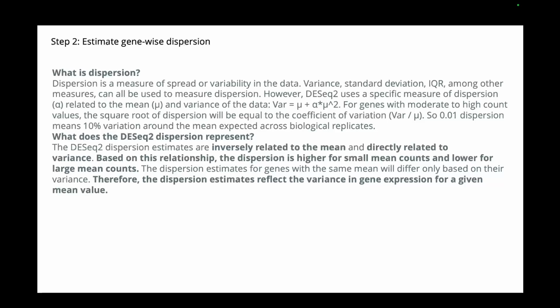So what you are essentially doing is checking, around the mean, how much your data is getting dispersed, how much is your spread. So say, for example, in one sample you have taken the mean across all the 20,000, 25,000 genes you have got, and then what you're checking is, with the mean in the middle, how spread out your data is on both sides of the mean.